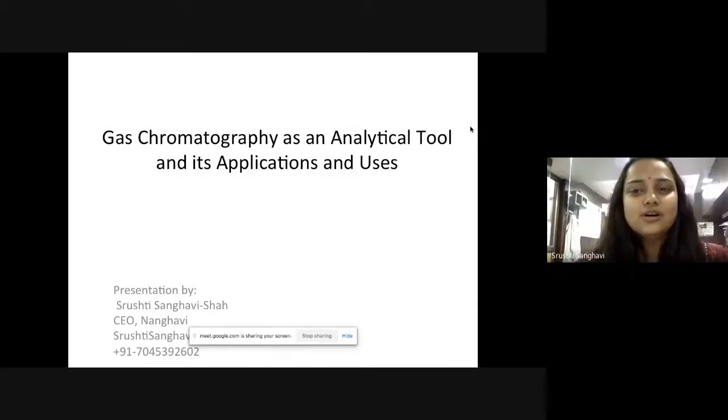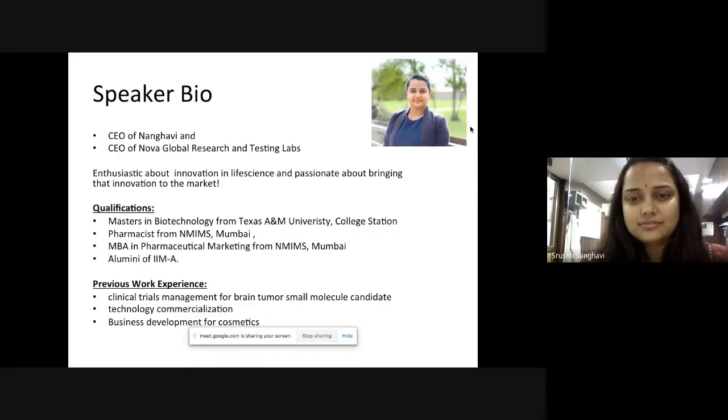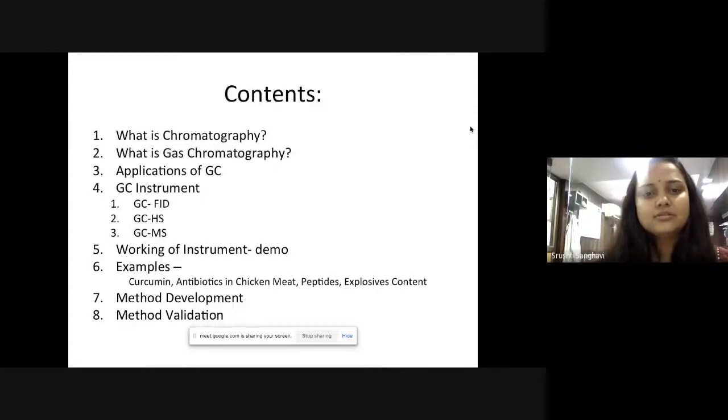Okay, so today I'm going to talk about gas chromatography as an analytical tool and its applications. So this is going to be what we're going to talk about today on a prima facie level.